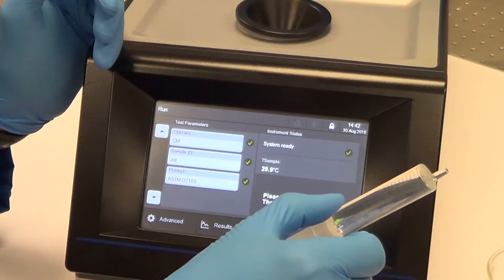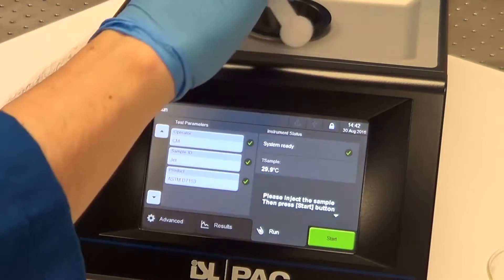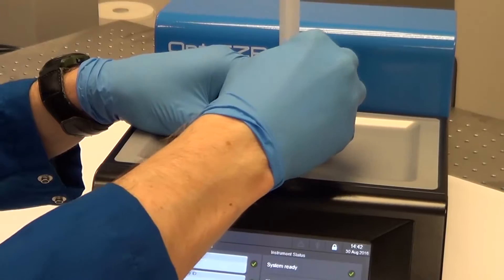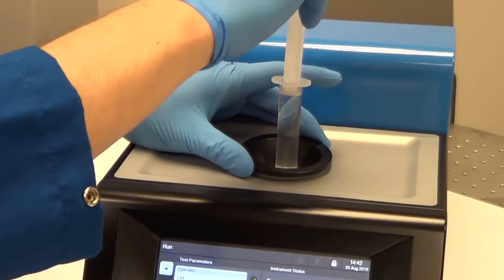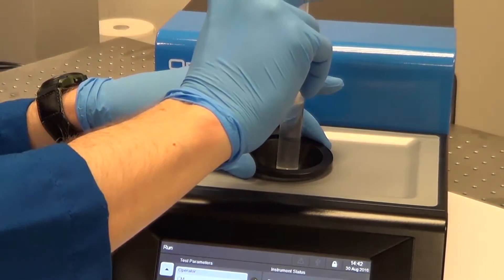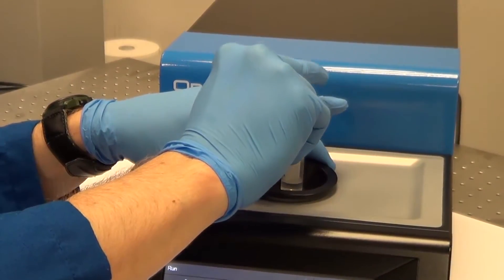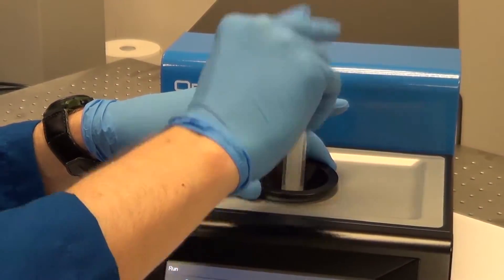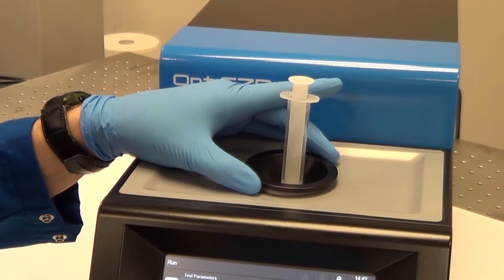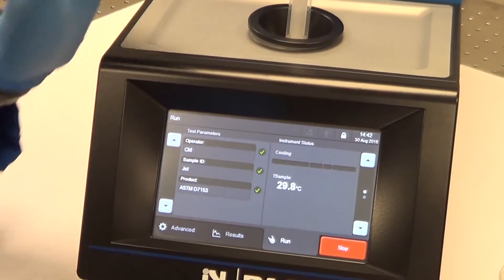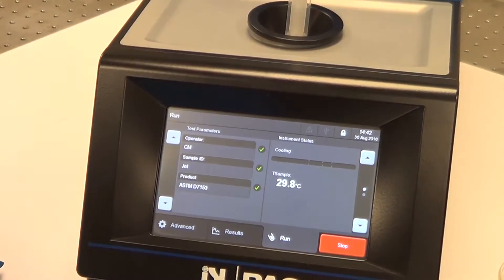We have our sample here; we just inject it into the inlet port on the top. Press start, and it's as simple as that.